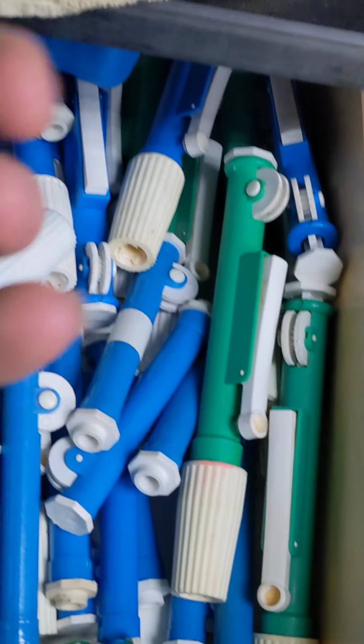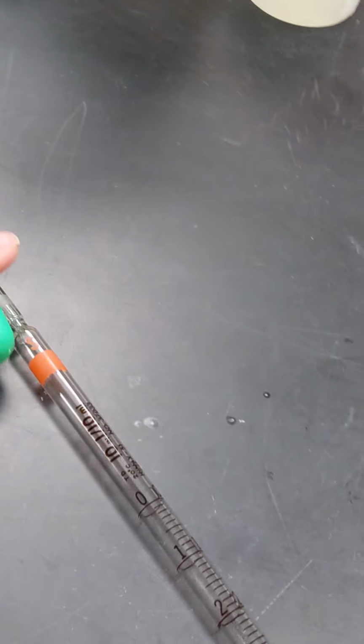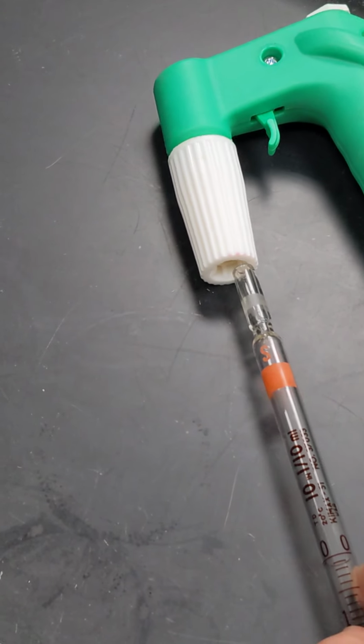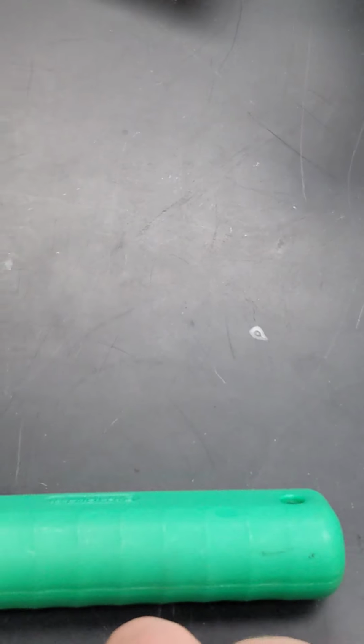And we grab one of these handles. So I'm going to go ahead and walk back here, get my little tour through my prep room. This goes inside of this. See if I can do it one-handed.